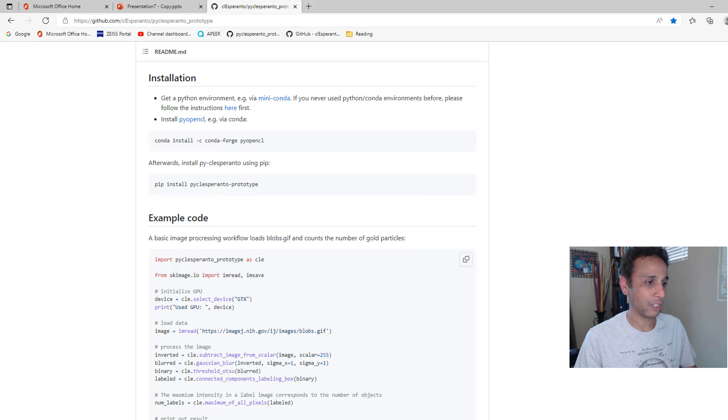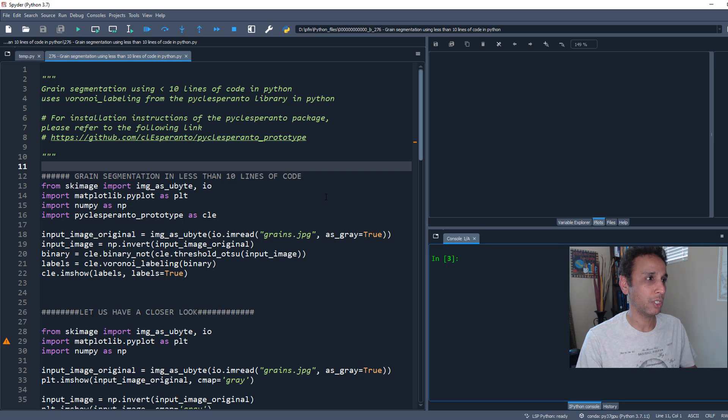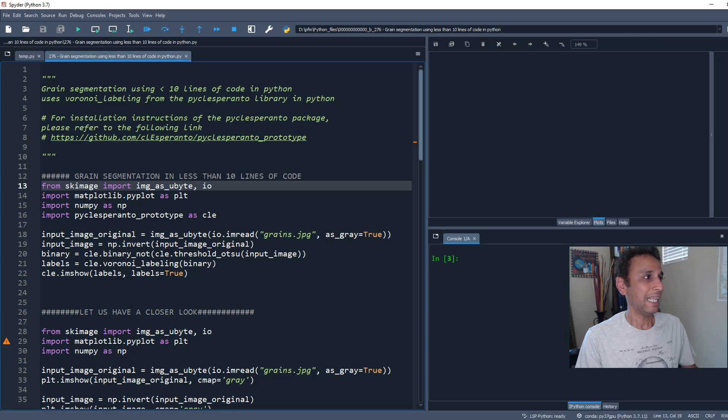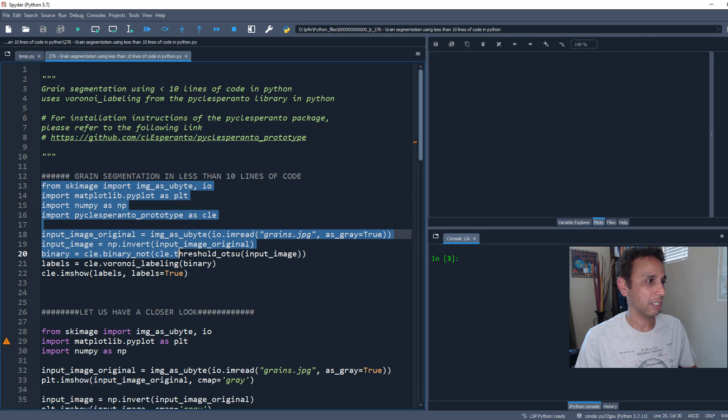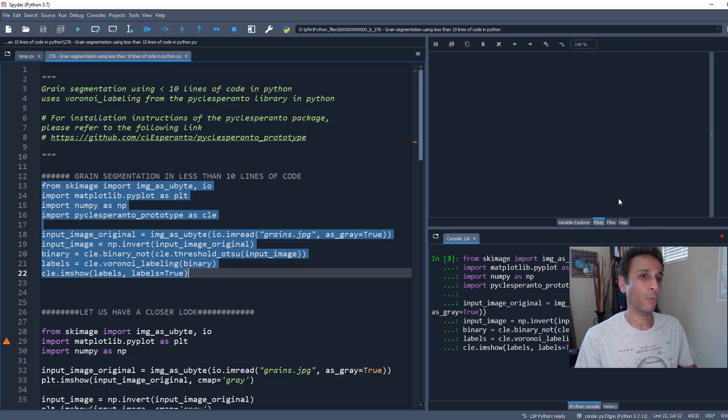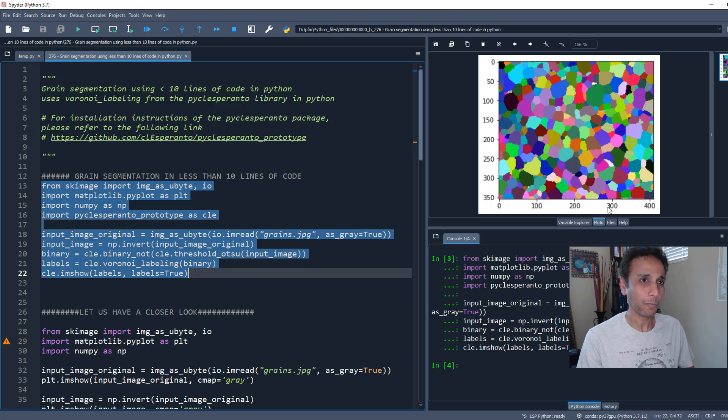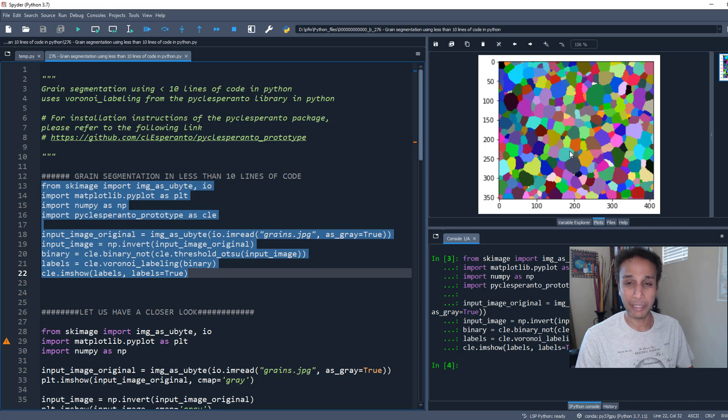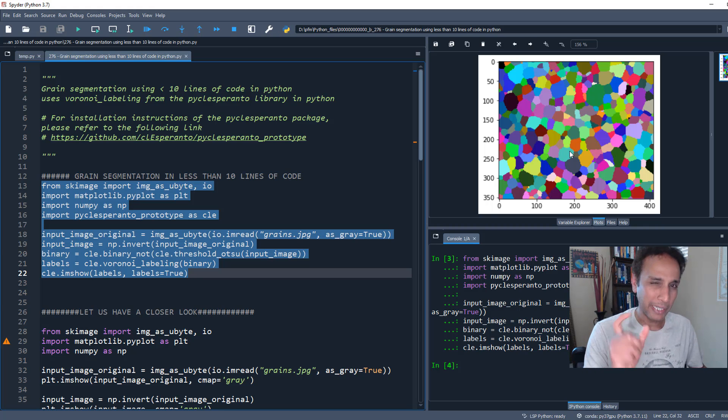Let's jump into our code. First, let's count it - this will be ten or nine lines of code. When I run this, you'll see everything segmented right away. There you go, that's the input image and this is the segmented result.